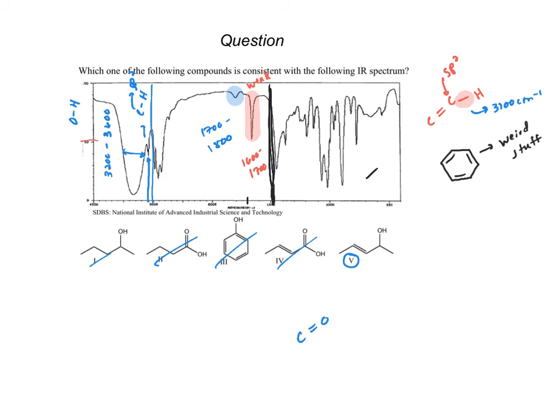In that structure, this bond is not a single bond. It is instead a double bond. So even though it's a small fraction of the molecules that have this, it's there, and you can see that in spectroscopy. So how do we know that resonance exists? Well, it's right there. It's a carbon-oxygen double bond.